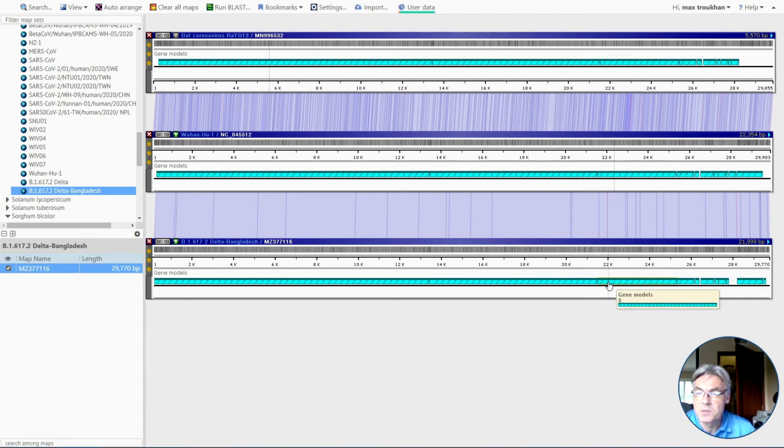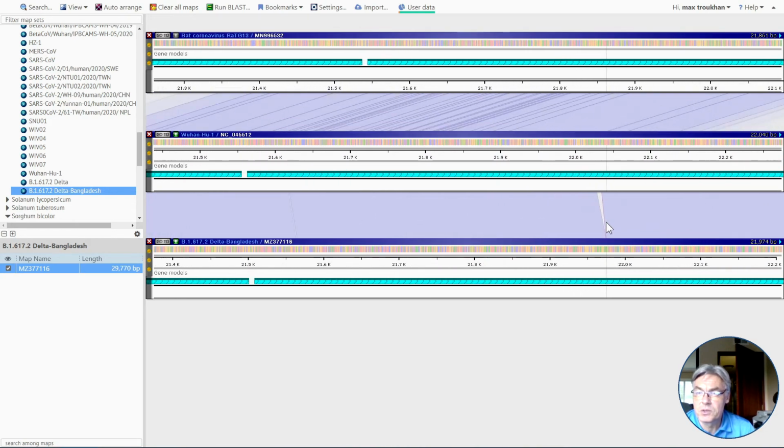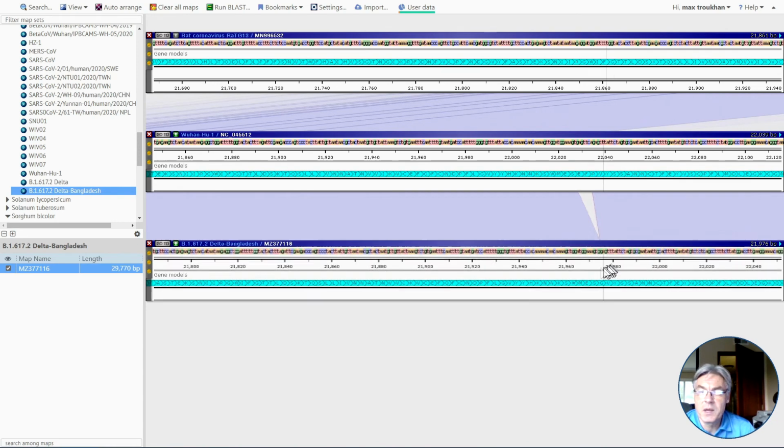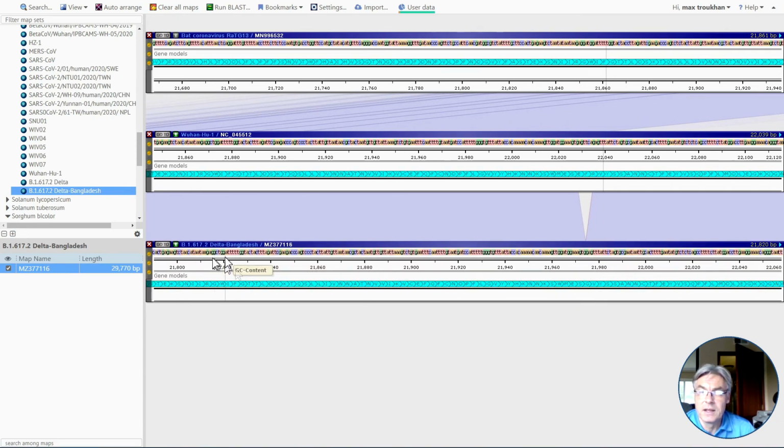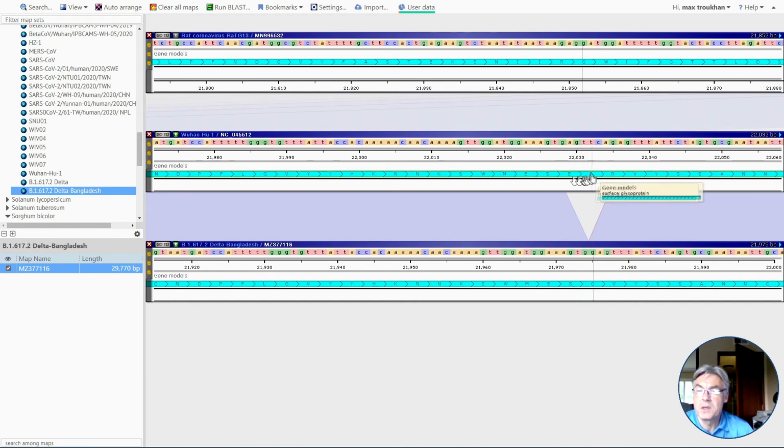This one is the spike protein, S protein. The red one means there is an insertion or deletion. So when we compare the Delta variant to Wuhan, and we know this one is more transmissible, this could be attributed to these differences. We miss a few nucleotides that result in amino acid changes.